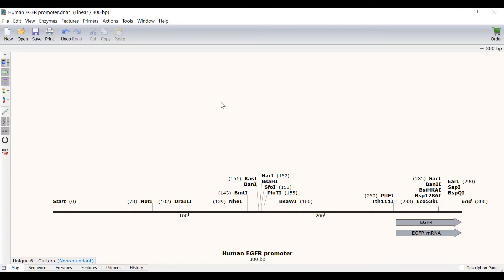Specifically, I want to add a site for ACC651 to the beginning of the sequence and a site for XHO1 to the end of the sequence.